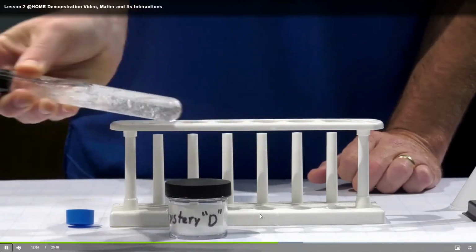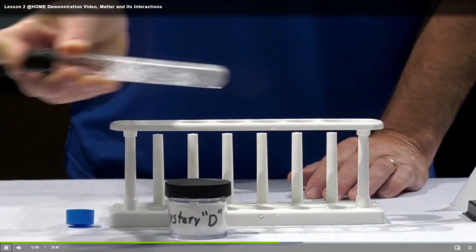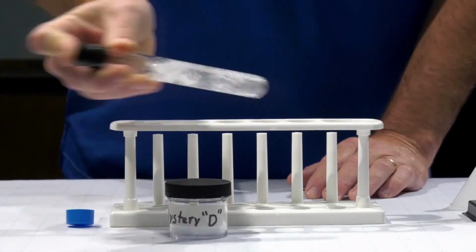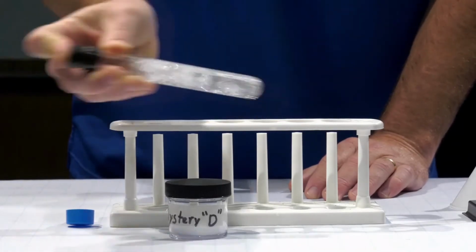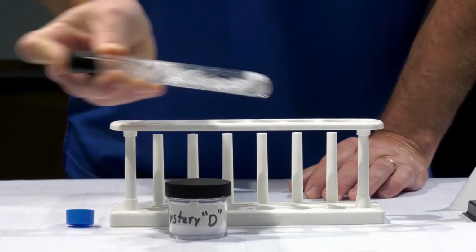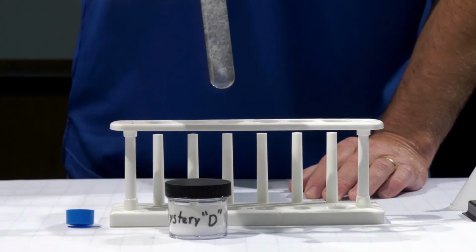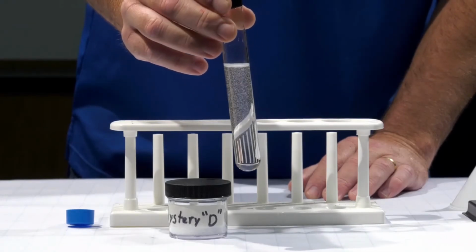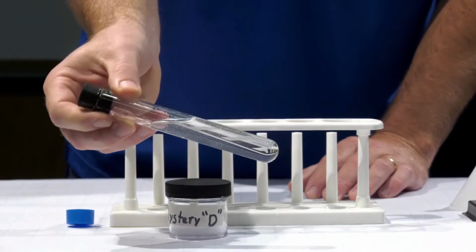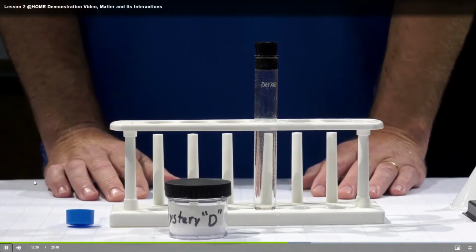Shake it up. Crystals definitely are not as big as the Epsom salt. The Epsom salt seems to have the biggest crystals. So it's probably not that one. So looking at this one, it looks pretty clear. So remember, one of them was kind of fuzzy. I believe borax resulted in something kind of fuzzy.